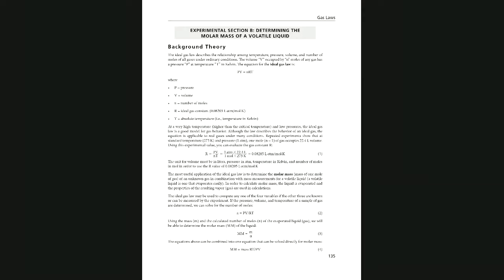We are going to measure the volume, which is the volume of the gas. The Erlenmeyer flask that is used is a 125 mL Erlenmeyer flask. We are going to fill it all the way up and measure the volume of this flask, by filling it with water and measuring how much water it holds. I would follow the procedure for that.